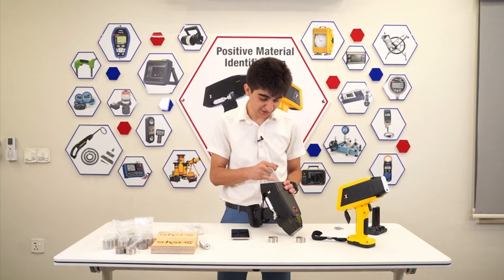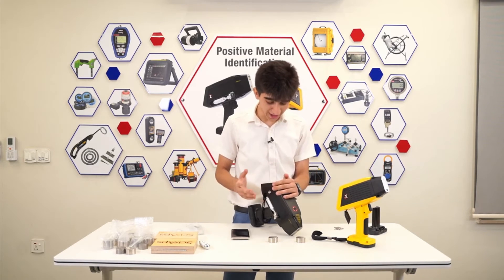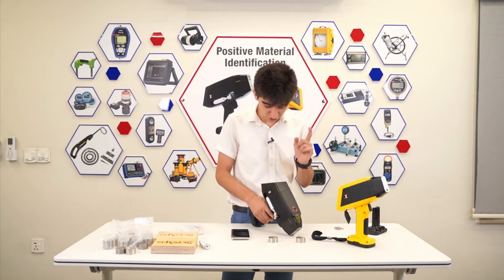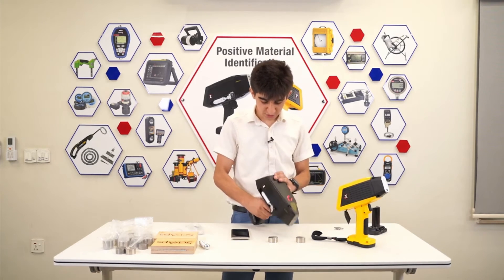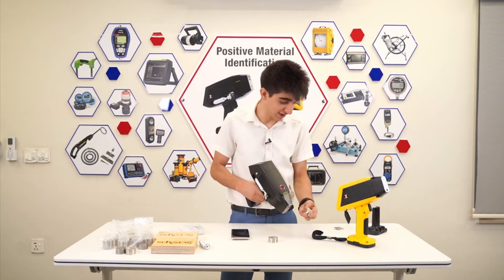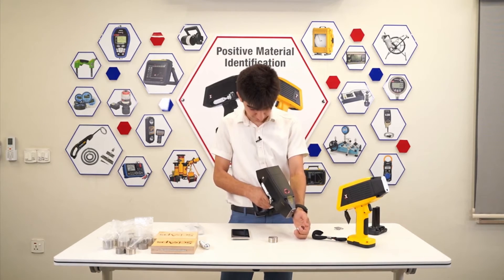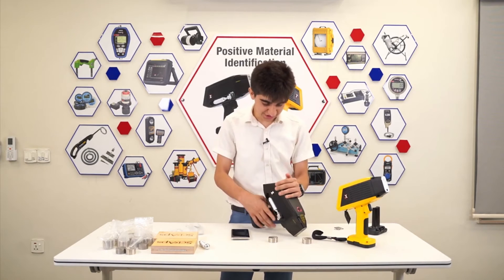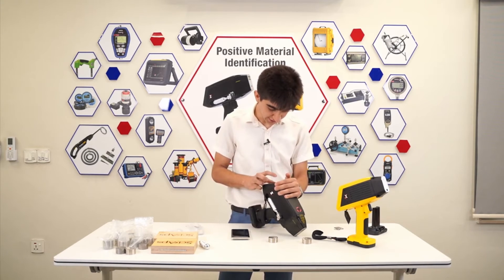As you can see, it shows the number of tests and the grade match, which in this case is 316 — 100% match to AISI 316. Again, with this unit, you can take a picture. You have two different cameras — the micro one and the macro one. I'll use this one. You can take a picture of the block you just tested. Press the trigger and the picture is taken. I press Save and, just like we did for the 304, we name the sample. We'll say '316 Certified Reference Material'.